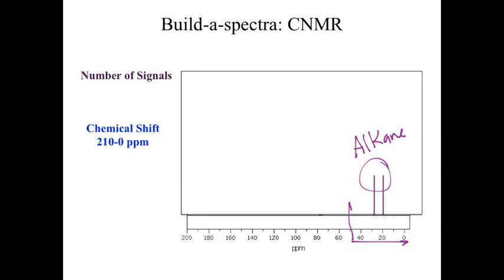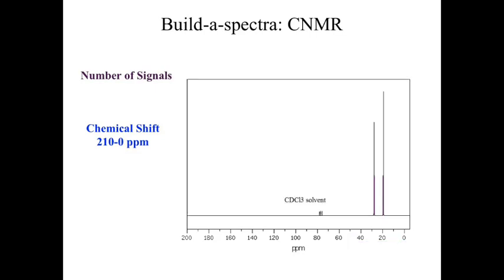Okay, so let's actually put up the real spectrum. The actual spectrum, you'll notice there is some differences in peak height. In carbon NMR, we really don't want to worry about that completely, and I'll talk about the exception in a second. The other thing that we might see in carbon NMR is a triplet of, or 3 signals all stacked up right around each other, about 77.